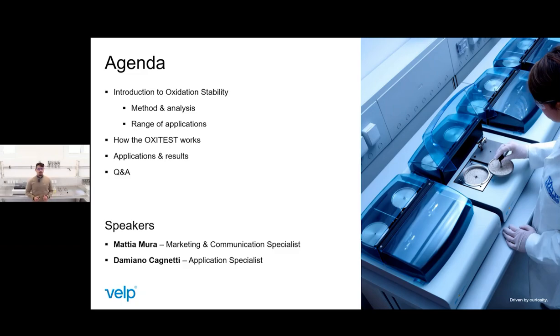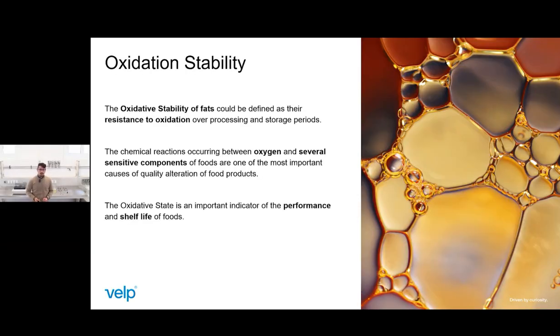We will start with an introduction to oxidation stability. We will see a method, type of analysis, and range of application. We will see how our Oxitest, which you can see here, works. And I will leave the stage to Damiano, and with him we will see in detail application and results that we obtain throughout different types of samples.